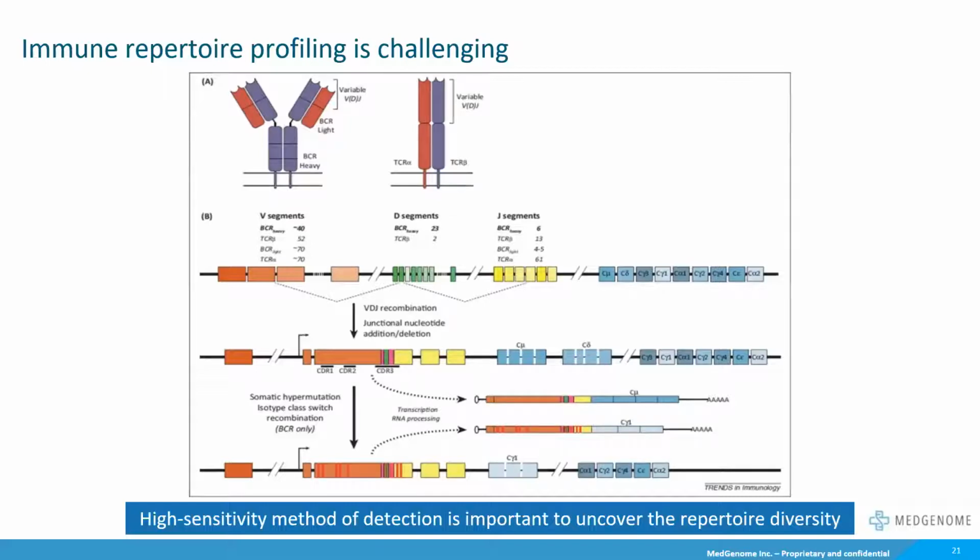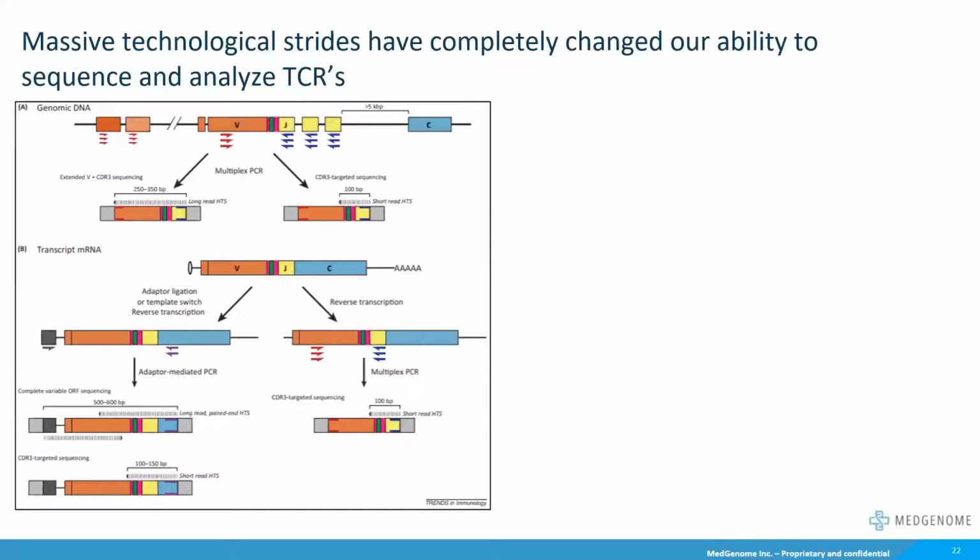This T cell diversity is what we call the T cell repertoire. And the implications of this are tremendous. They can be therapeutic in terms of identifying specific antigens that are specific to TCRs or creating TCR engineered cells. From a diagnostic perspective, you can assay TCR clonality. And from a monitoring perspective, you can look at treatment monitoring by assays looking at the TCR repertoire as well.